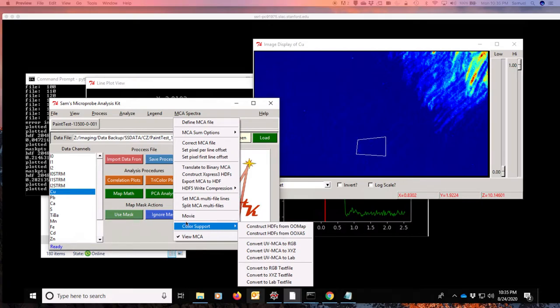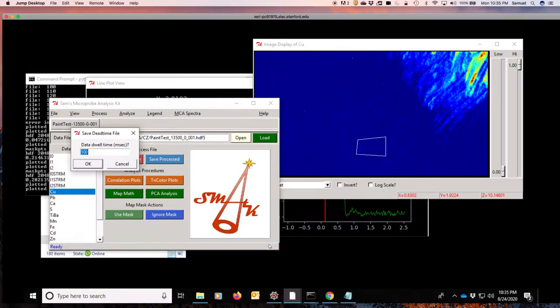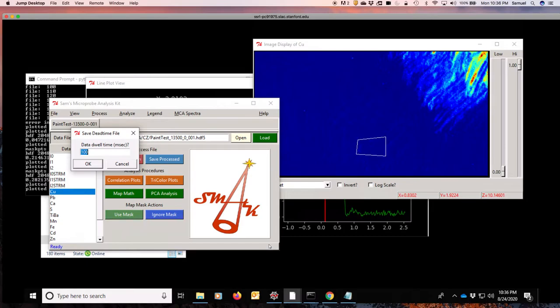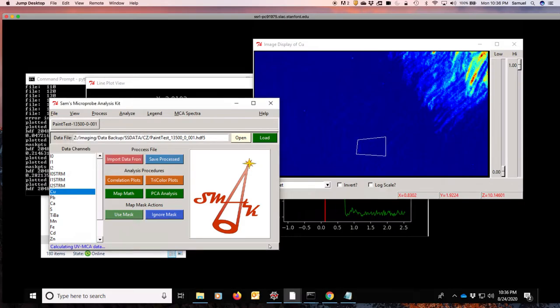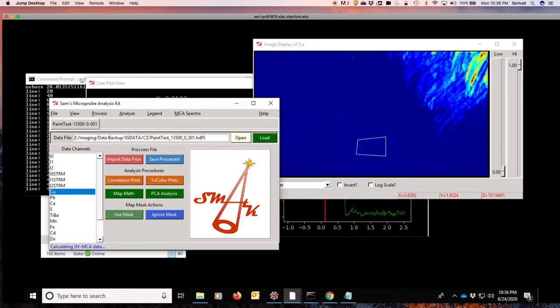So let's do the color support here. And we're going to convert this image into RGB information. The one thing it will ask you is the data dwell time. In this case, it is 100 milliseconds. But if you don't know what it is a priori, you can go into the data logs and see the record of the dwell time that's been collected. This will now go through all of the data and process and integrate the spectrum to make what your eye would see by red, green, and blue. This process also takes a few minutes.